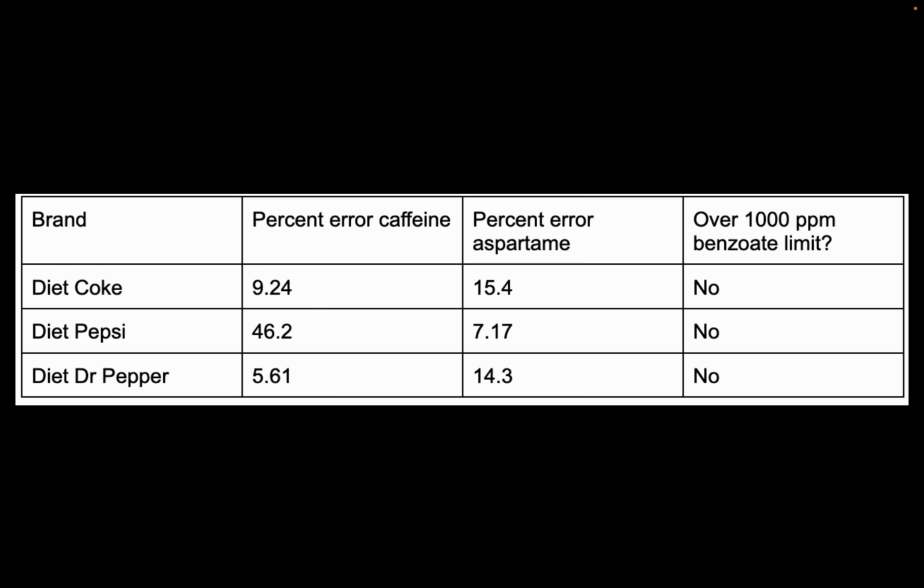Percent error on aspartame, though, look at that data. That is, well, not great, but I'm satisfied with it. 15% error, I'll take it. It could have been like 30%, you know. So it's decent data. It's decent.